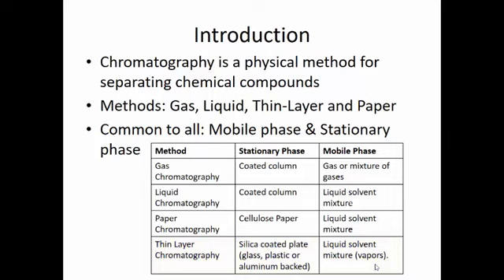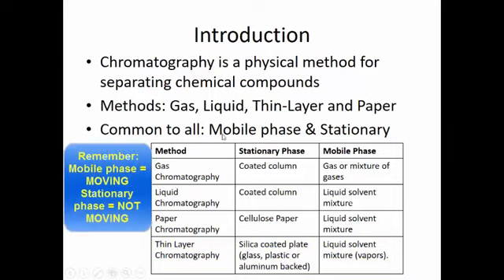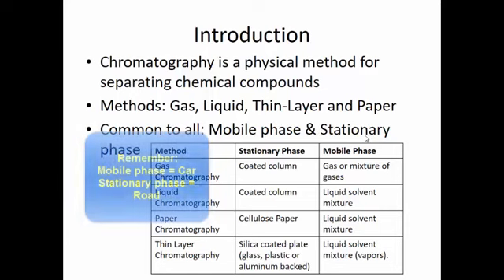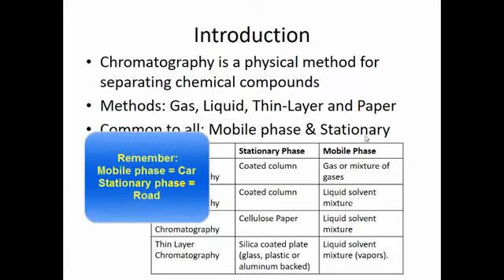All right, one of the things that you need to remember are these two phrases: the mobile phase, which is the phase that actually moves, in this case the gas or liquid or mixture, and then your stationary phase, which is the phase that actually does not move. That's the phase where your molecules either pass over or are added to and then allowed to move across it either through capillary action or some type of wicking action or something like that. All right.